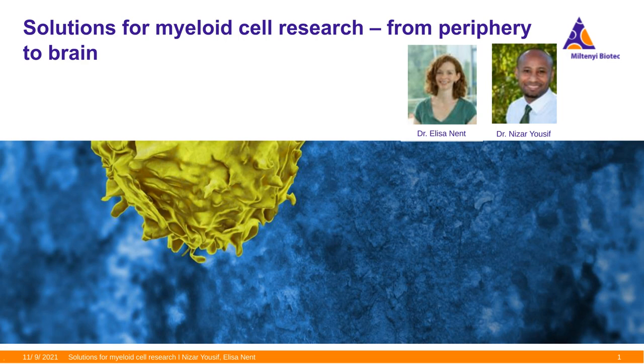For the inflamed brain, so what I showed you here, we recommend the multi-tissue dissociation kit because if you are working with the inflamed brain and you are interested in immune cells, so in infiltrating immune cells, you need to make sure, or at least if you want to isolate those immune cells later on with our microbeads, you need to make sure that the kit and the beads fit to each other. In case of the neural cells and the adult brain dissociation kit, this works. But for some of our immune cells, the epitopes are quite sensitive. So the multi-tissue dissociation kit works better.